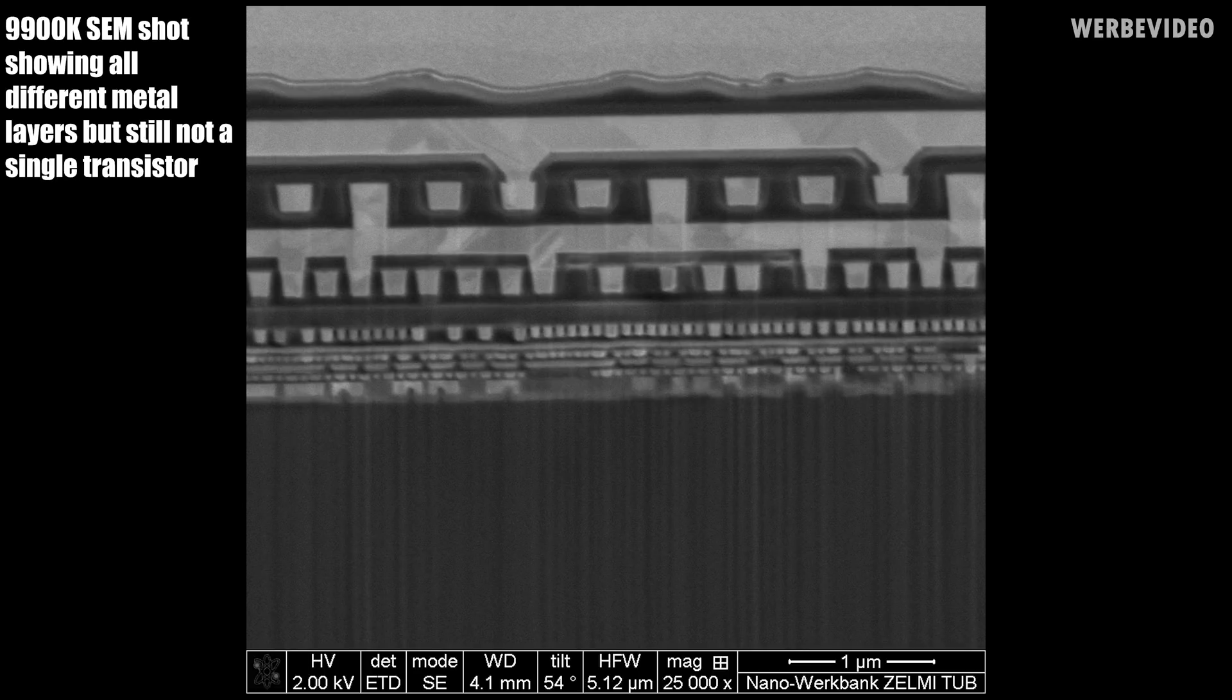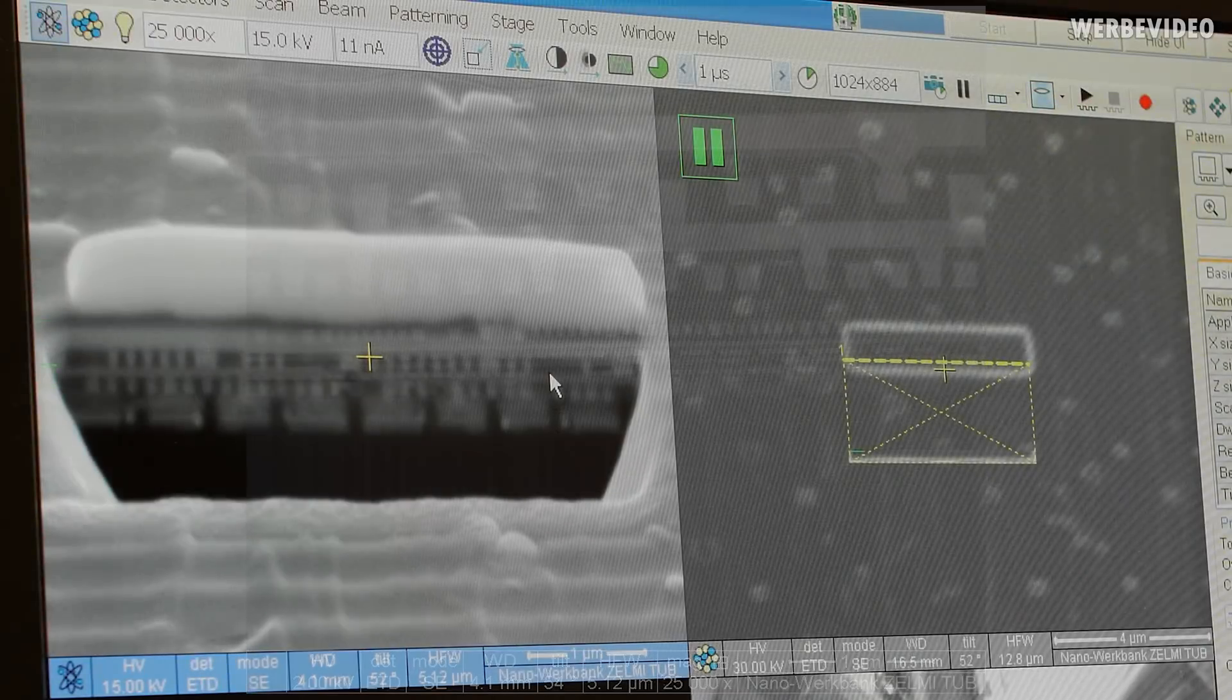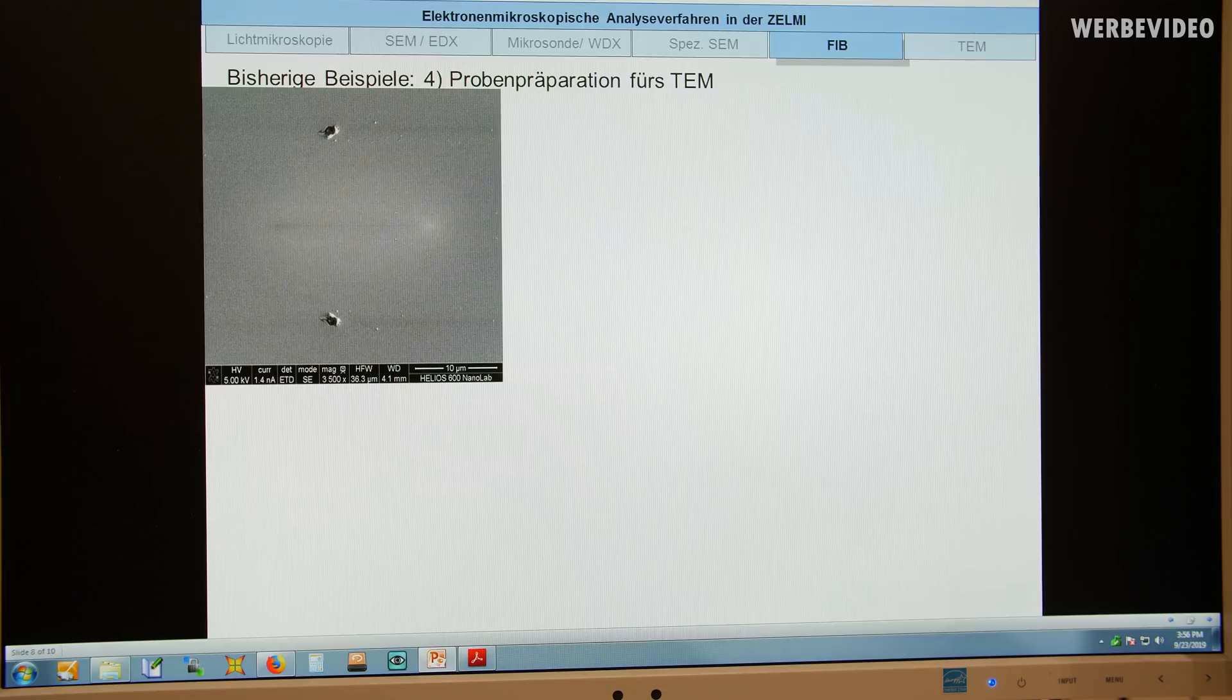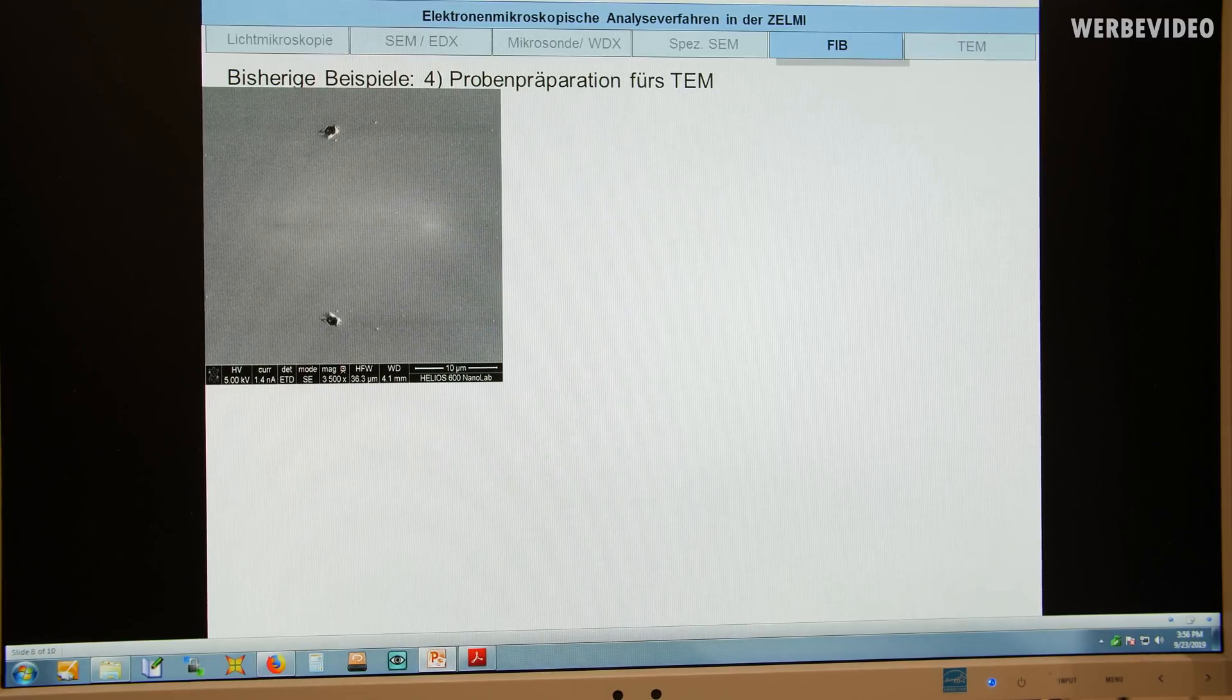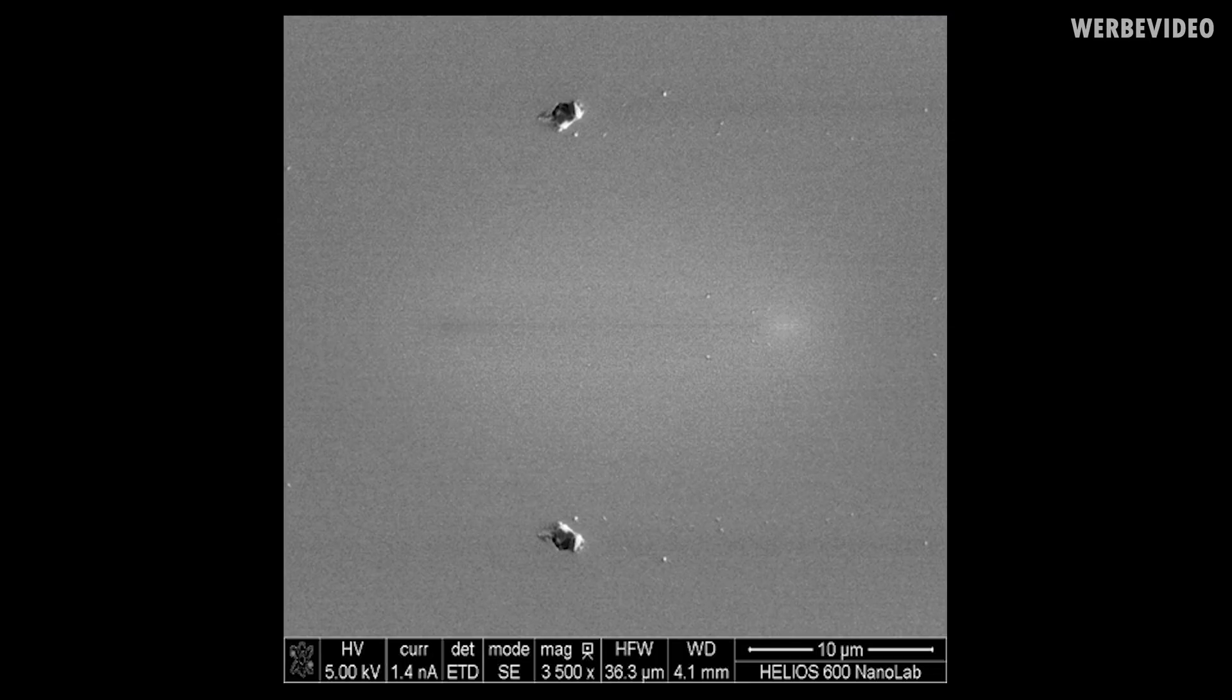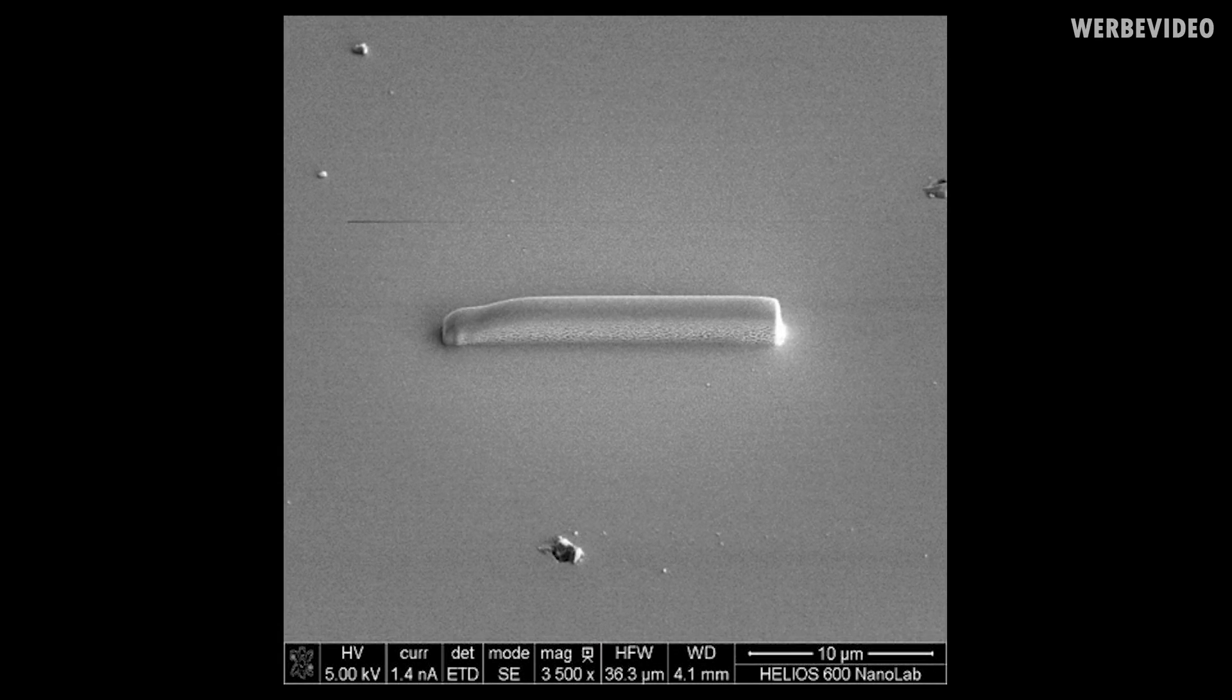So that's why we will cut the small lamella out of the material and put it into the TEM. And I will just show you in a quick presentation how this lamella is removed out of the material and then put into the TEM. Okay, so what can we see on the top left image in this presentation? Yeah, this is the surface of the specimen. And we now want to cut a TEM lamella that is perpendicular to the surface of the specimen. And the first step is the same again as we saw before. We have a platinum protection layer that is deposited on top of the surface.